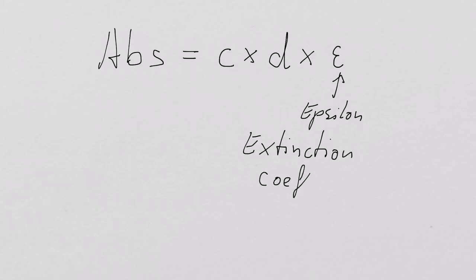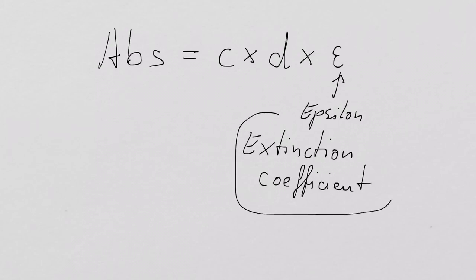Now, what does this epsilon actually depend on? It depends on the right wavelength. So epsilon depends on wavelength.